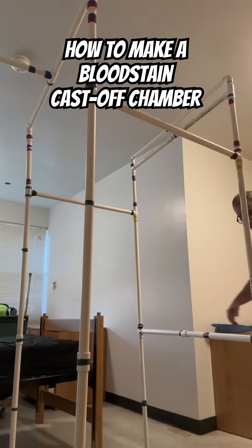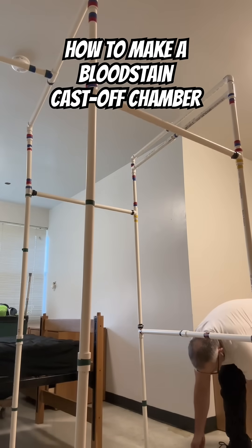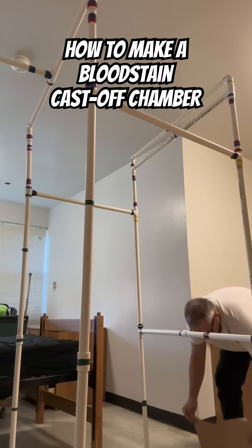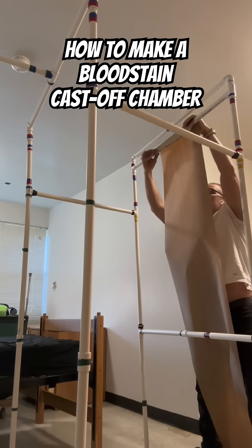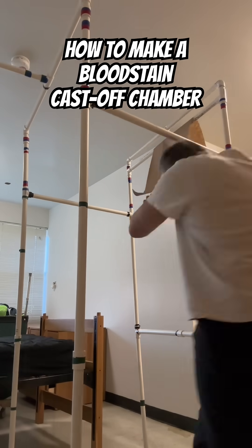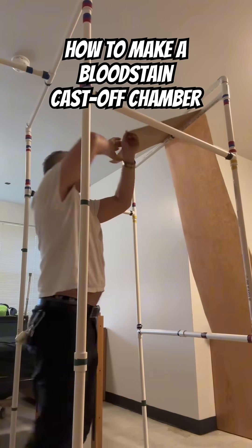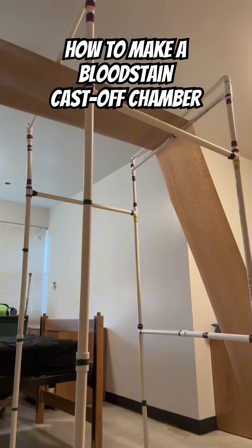Let me show you how it works. So this would all be covered in plastic. This is for cast-off stain, and what I would do is run my paper through here and then that's going to come all the way across here.